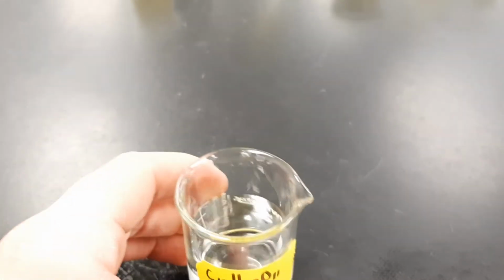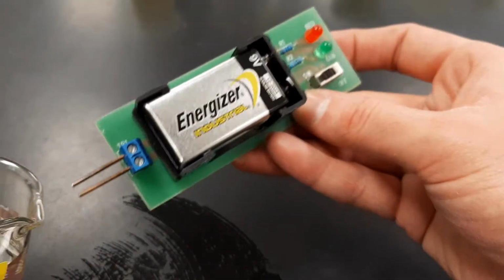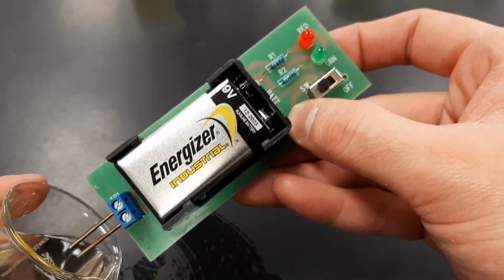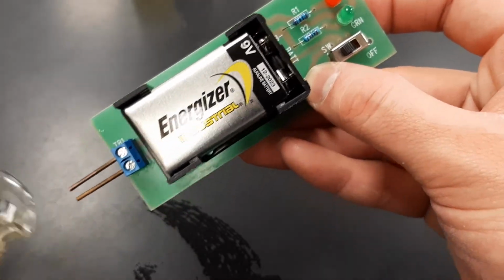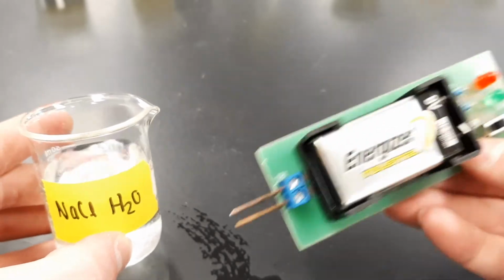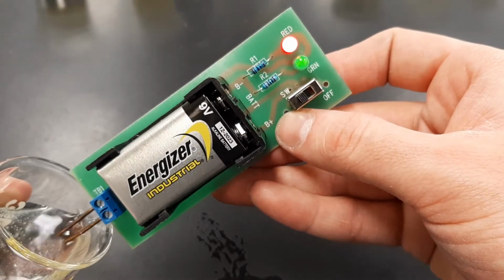Now is going to be our sugar water, C12H22O11, inside H2O. If it is lighting up, make sure that you indicate how strongly the light bulb is lighting up. That may indicate if this is going to be a strong conductor or a strong insulator. Next item is going to be our NaCl in H2O. That is our salt, the NaCl, in water.